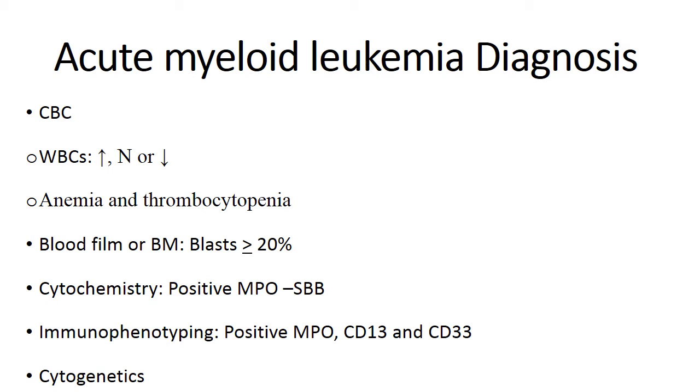Immunophenotyping will find the myeloid markers on the myeloid blast in the form of positive myeloperoxidase, CD13, and CD33.